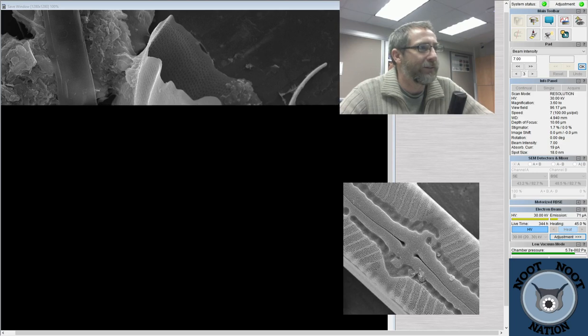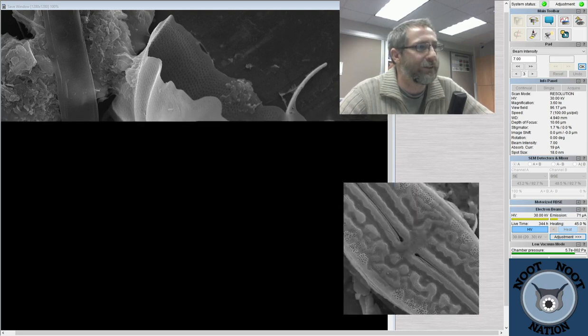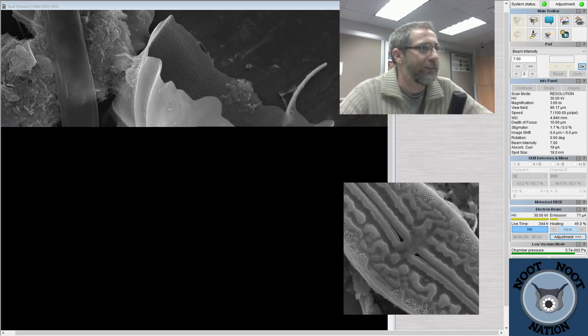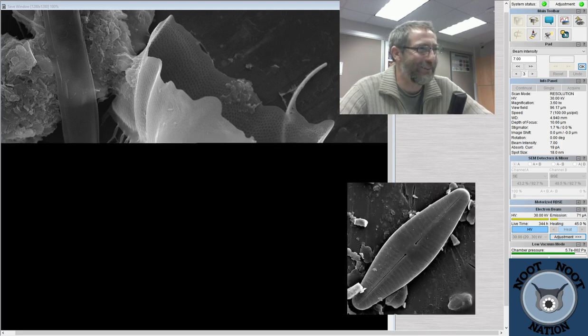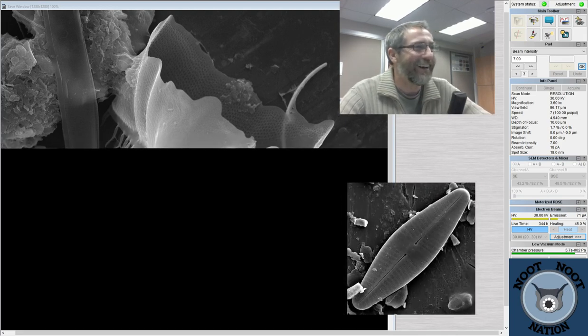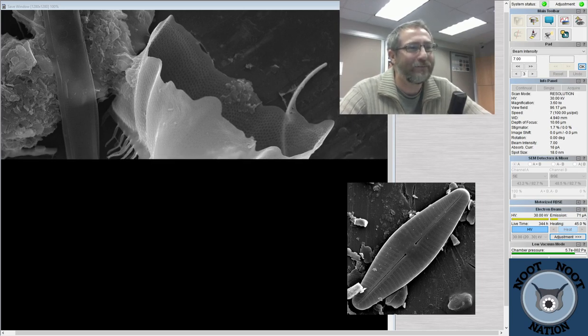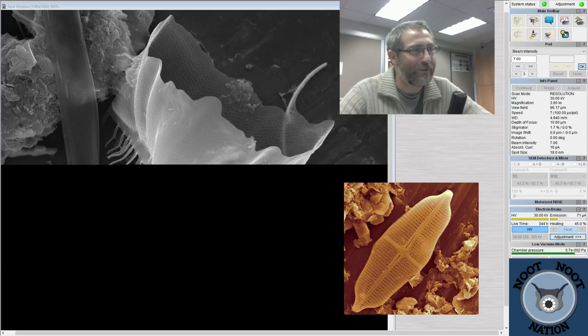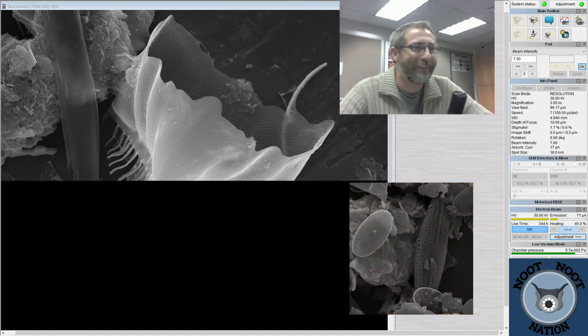Steve Mandel asked, what diatom are we looking at? Ditylum is the genus. As I mentioned, we sometimes see them on Pacific Plankton Stream. It looks like she caught that. You appreciate the science that I do, but diatoms can be nightmare fuel? I don't understand how you could find diatoms nightmarish. They're harmless for the most part, and they are oxygen generators and part of the food web, and they're tiny. They're dust-sized.